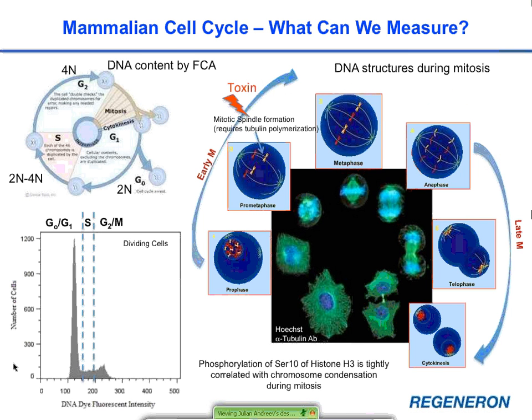As I mentioned previously, most toxins used for conjugation in ADC projects bind tubulin and cause cell cycle arrest at early mitosis. When you test your ADC in vitro and subsequently in vivo, you want to make sure that cell cycle arrest is indeed happening in a toxin-dependent manner in the cell culture to confirm the mode of action. The most reliable way of measuring cell cycle arrest would be by DNA content and by flow cytometry, because of the high number of cells analyzed.